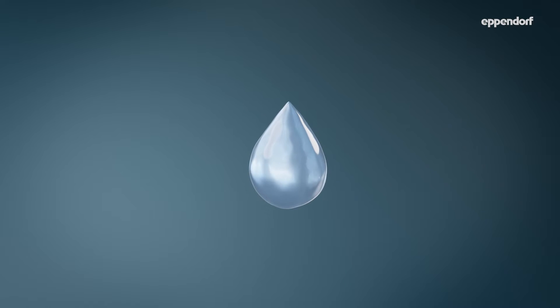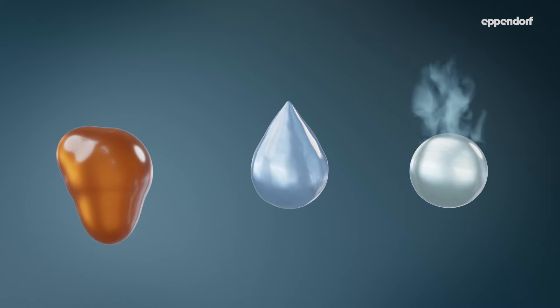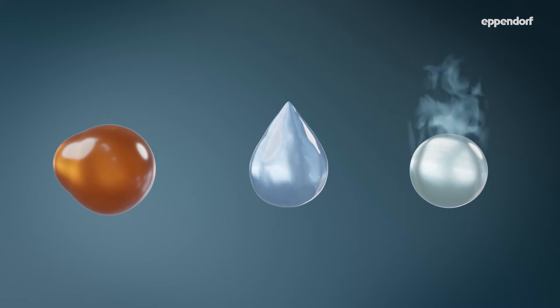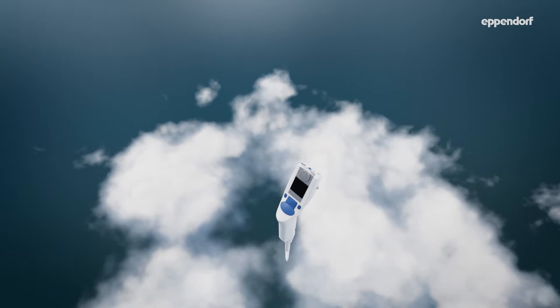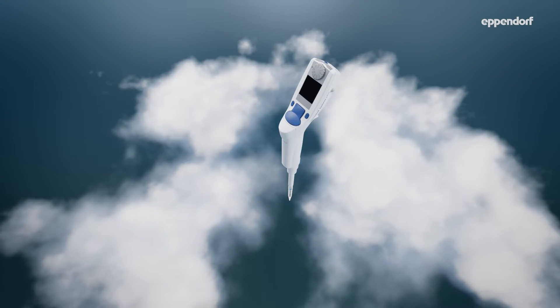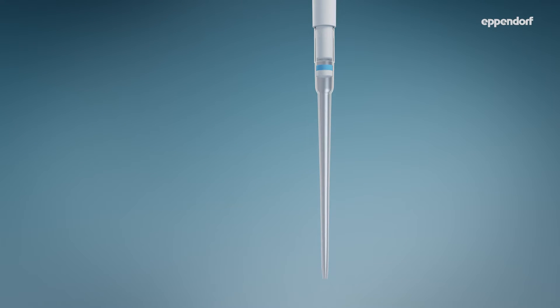Samples with physical properties that are different from water, such as glycerol or ethanol, sometimes require changes in the pipette's adjustment to improve accuracy. The adjustment should also be changed if the pipette is used at extremely high altitudes or when working with elongated tips.